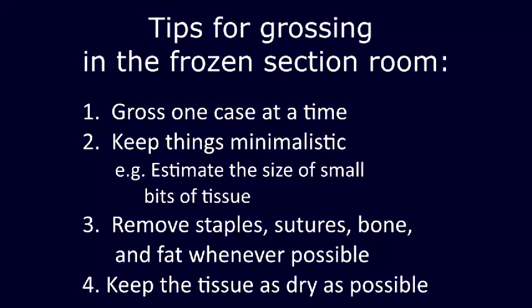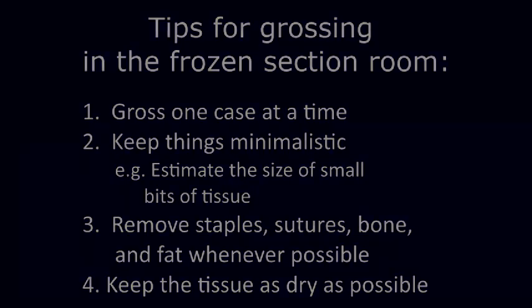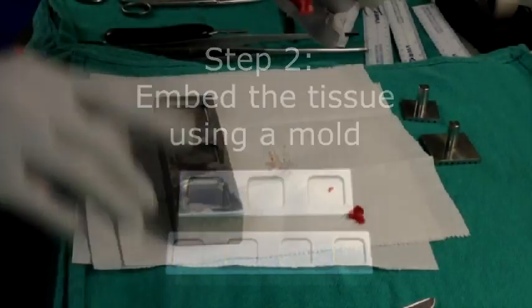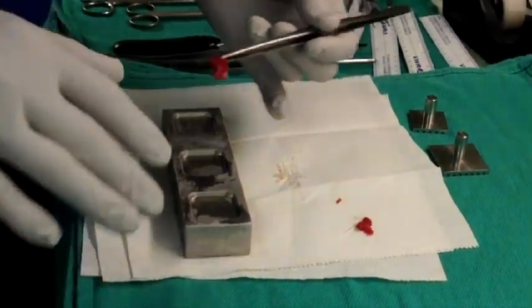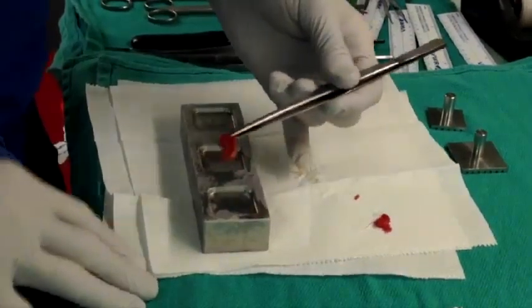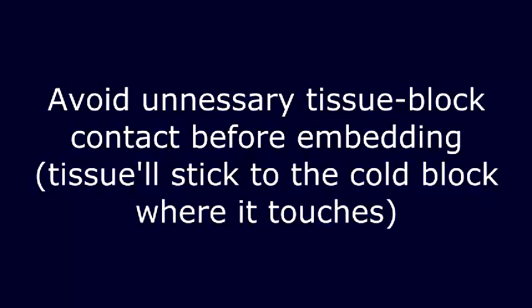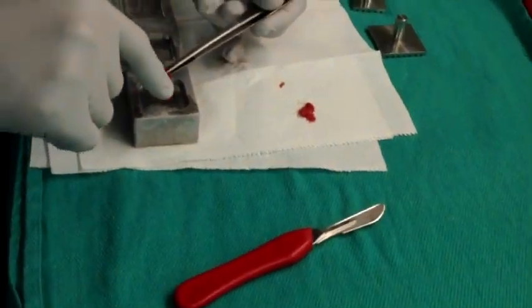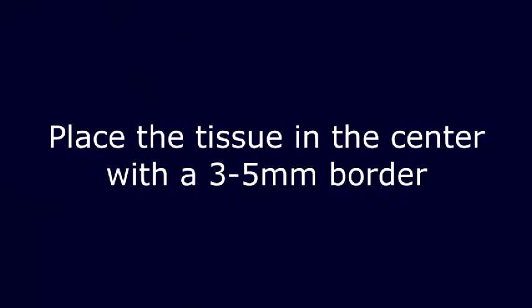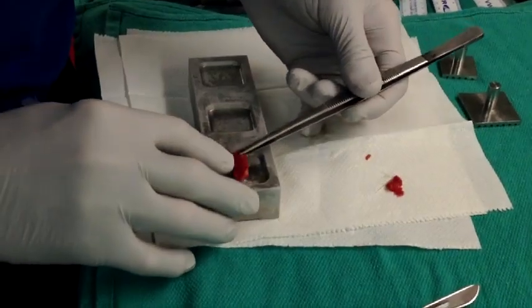The molds are kept in the cryostat. Take the mold out at the very last minute so that it doesn't warm up. When you put the tissue into the mold, you need to make sure that you control the tissue the whole way. Anywhere that you touch the tissue, it's going to stick. Control the tissue and make sure that you place it in the center of the mold so that you have a border of OCT around the outside. You're going to need that in order to tease off the section as you're cutting it. Try to do it in one motion.